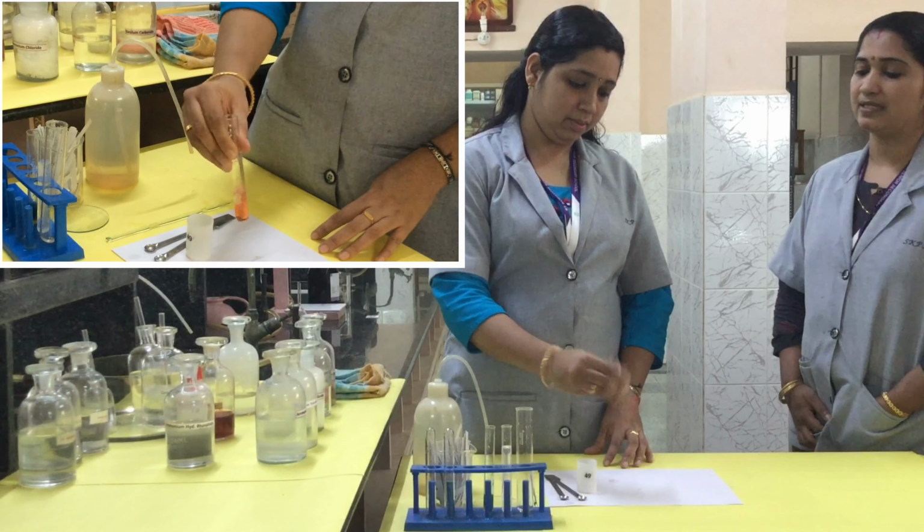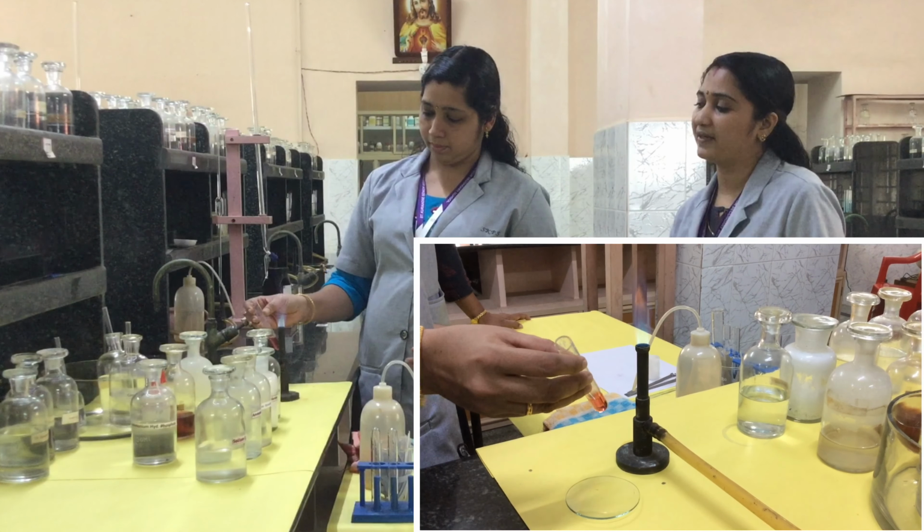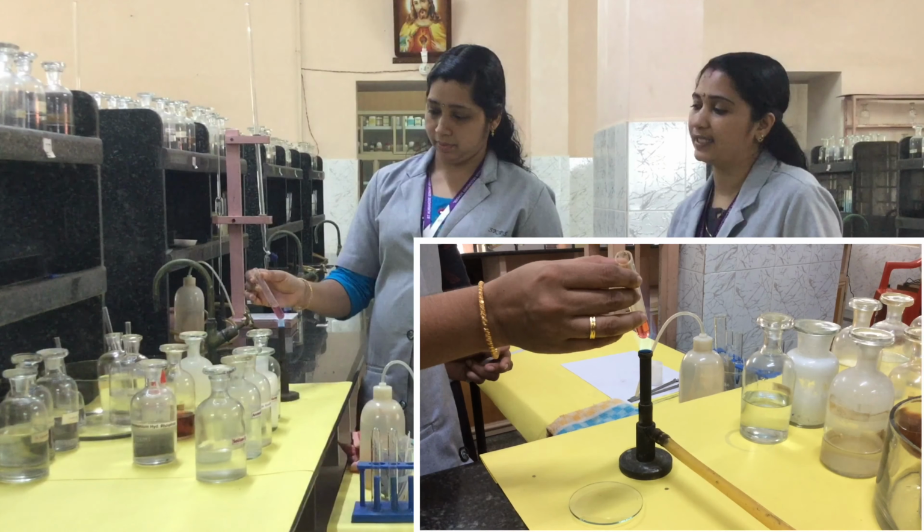So for the confirmation of magnesium in group 6, we also perform the ash test. We already added concentrated nitric acid and cobalt nitrate solution to the salt solution. Then boil the contents in the test tube, and into the boiling solution, dip a filter paper.